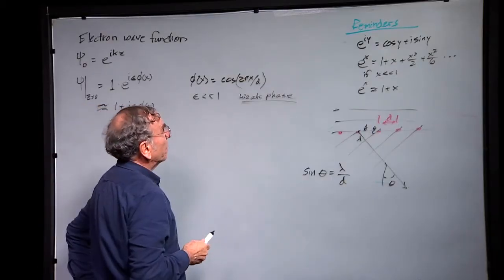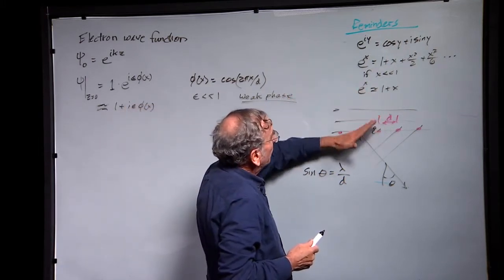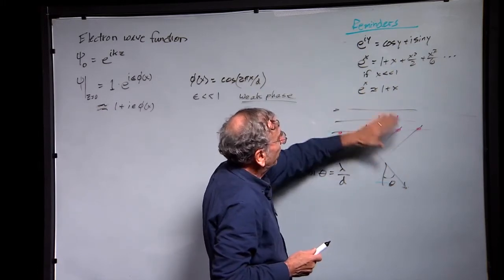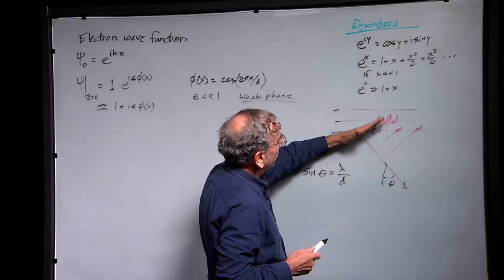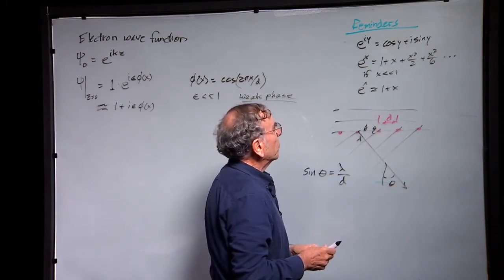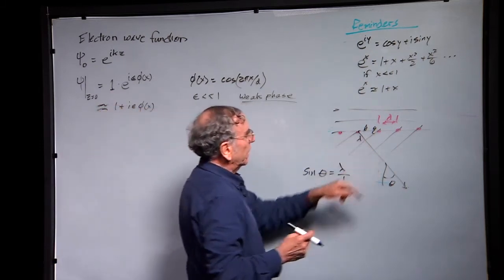of my grating. So we have an incident wave, and one of the things that happens when this wave hits my periodic phase object is a new diffracted wave takes off in that direction. And it turns out that we can describe this wave.